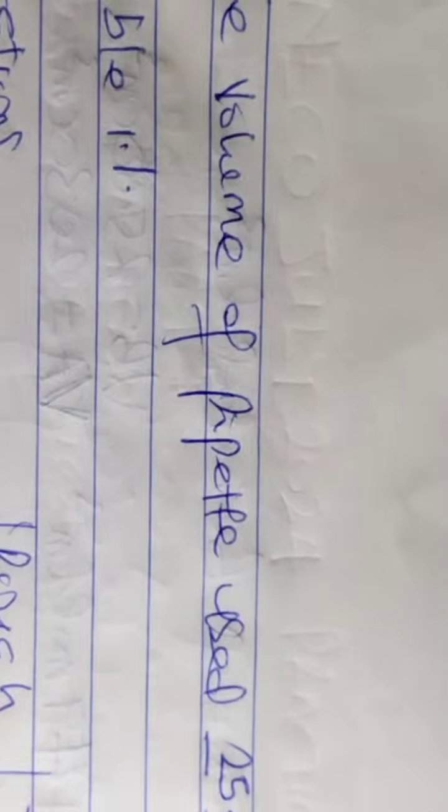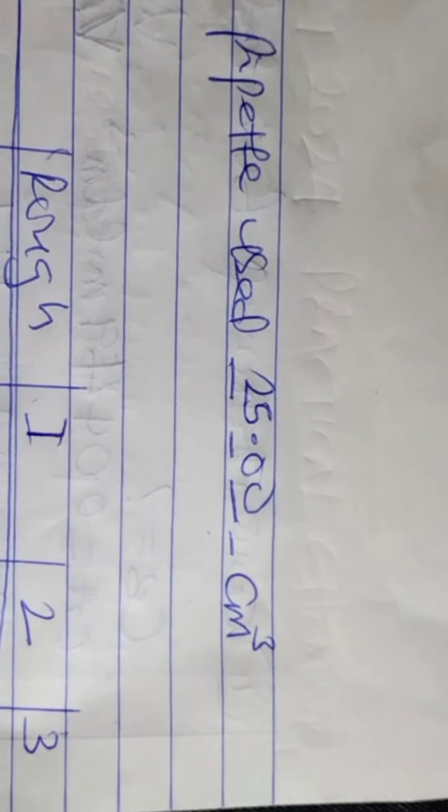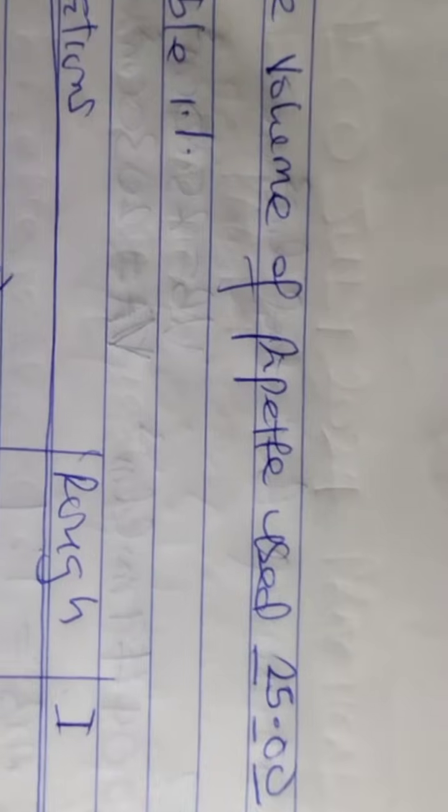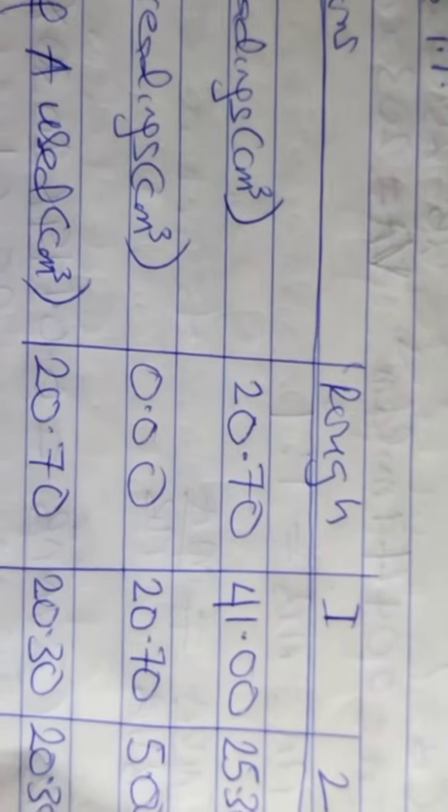So you can see table 1.1. The first is the volume of pipette used. You're given a gap to fill, and of course we have 25.00 cm cube. Fill to 2 decimal places. So the pipette used, the common one, is 25.00 cm cube. Then in table 1.1, we have titration, final burette readings, initial burette readings, and the volume of A used in cm cube.